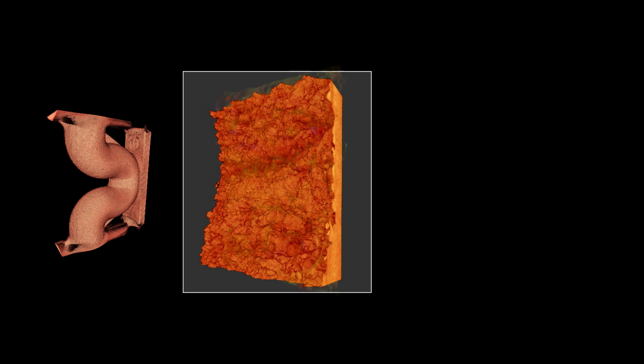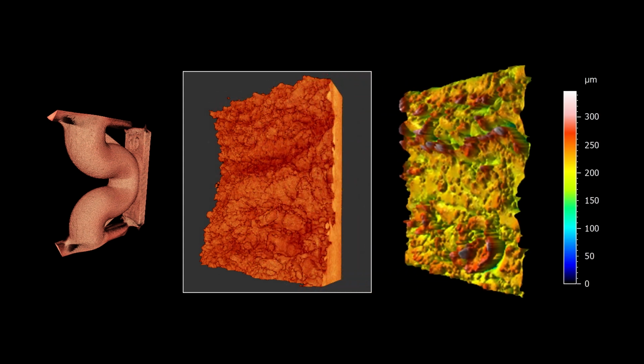Impurities, voids, and unmelted particles become visible. Roughness and topography measurements become possible for inner structures that are not accessible to any other analytical method.